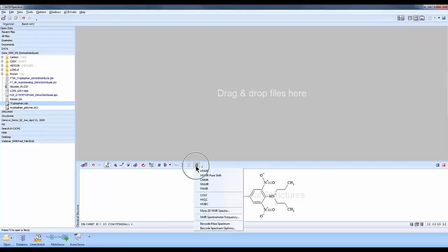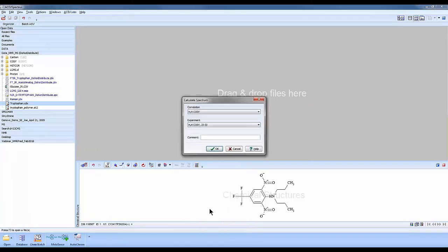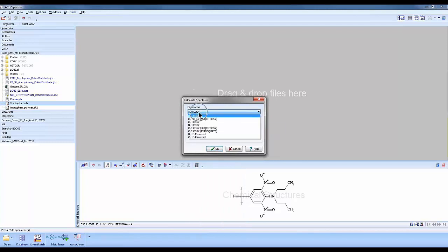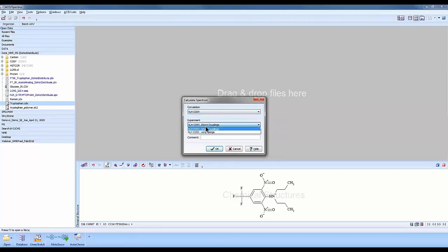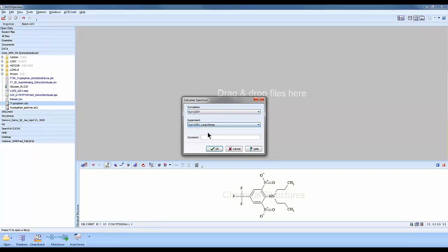If I go to my calculate button here, we want to select more 2D NMR spectra. In here we're going to select from the drop-down list the NH prediction for nitrogen, and then we're going to select an NH long-range experiment. So we're going to predict for an HMBC here. We'll click OK.